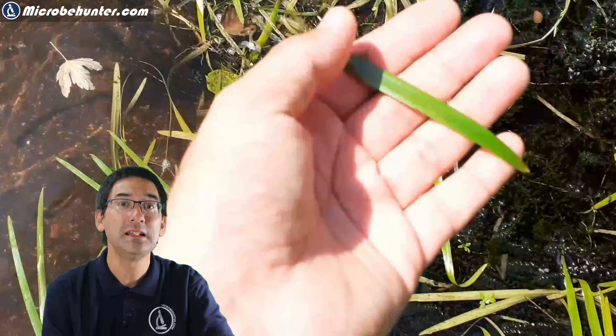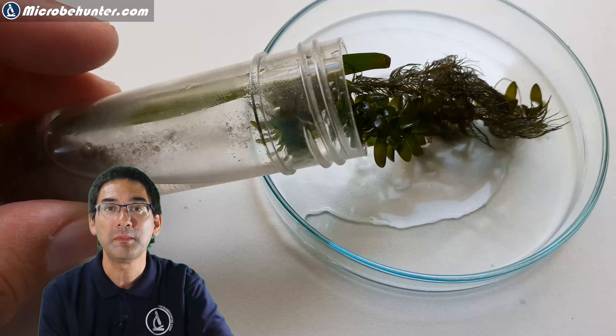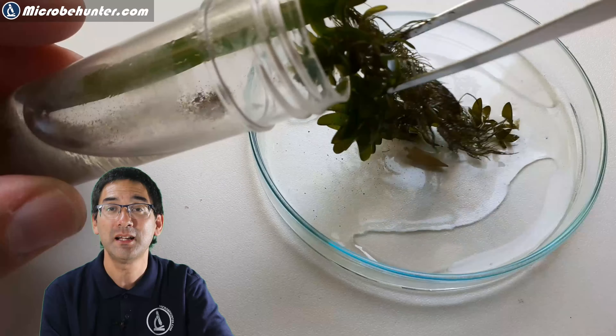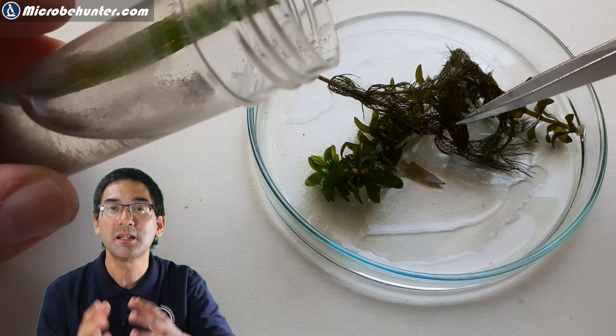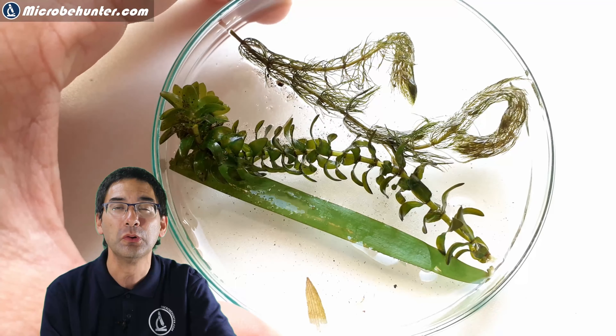I took some leaves from the water plants, put them into my little plastic container with a little bit of water, and back at home I had a closer look at these specimens. Indeed, some of those water plants did not look quite as clean as you might expect, and this is a good sign because there was some stuff growing on those leaves. I took one of those leaves to make a whole mount and put it directly on the microscope slide. At higher magnification, looking at the edge of the leaf, a whole range of different bacteria and other microorganisms started to appear. This is known as a biofilm.